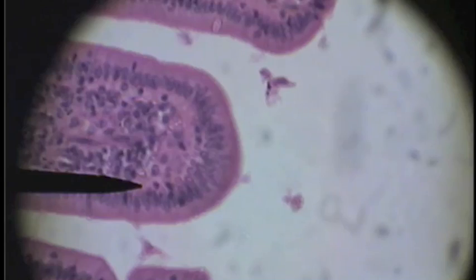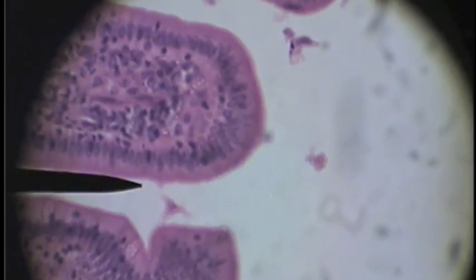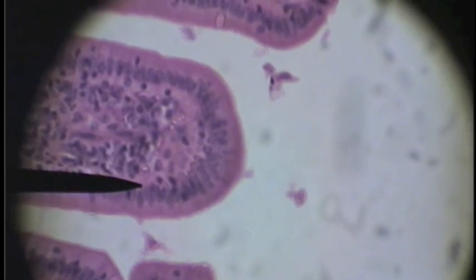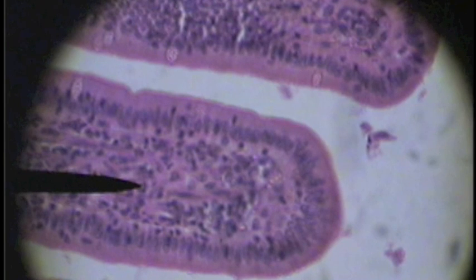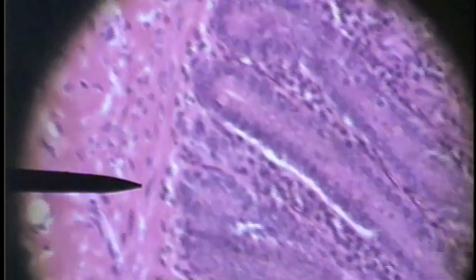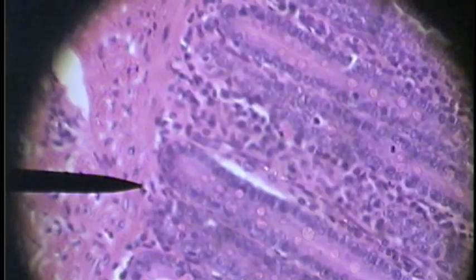Tunica mucosa. On higher power, as we look at the tunica mucosa, we can see the epithelial layer — this layer right here. Deep to that we have the lamina propria, which is found deep in the heart of all these villi. Deep into this tissue, we then come up on a thin layer of smooth muscle deep to the lamina propria — that's muscularis mucosa.